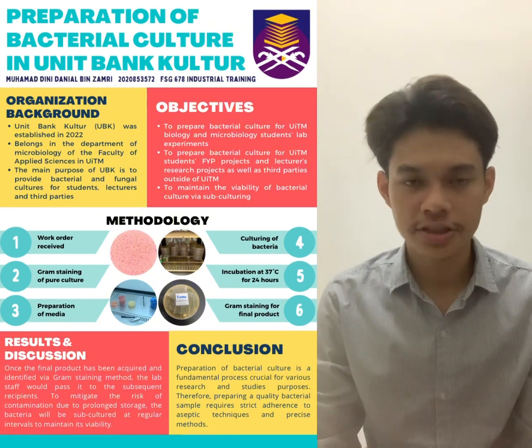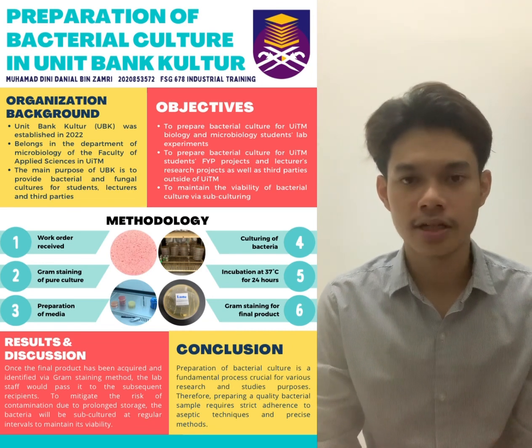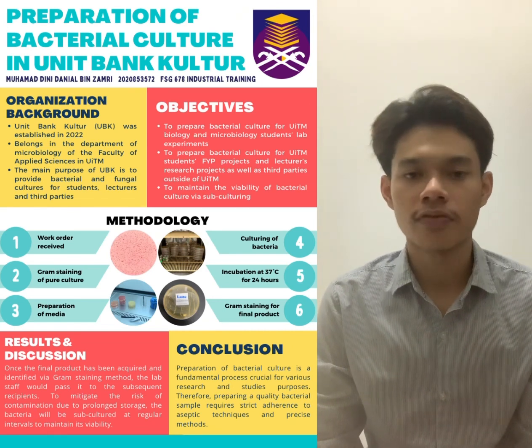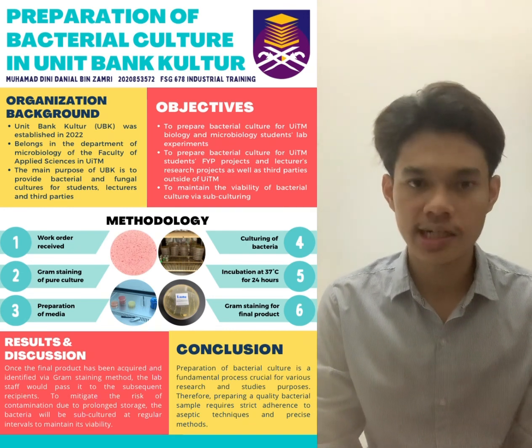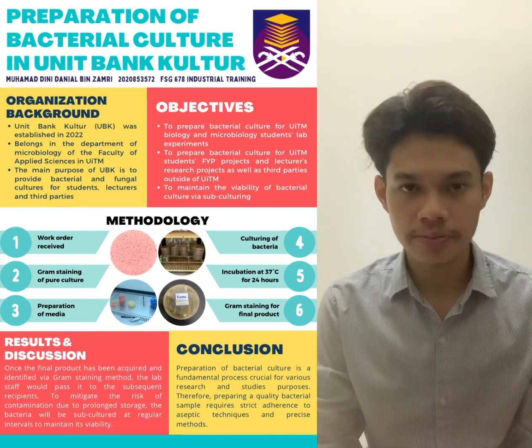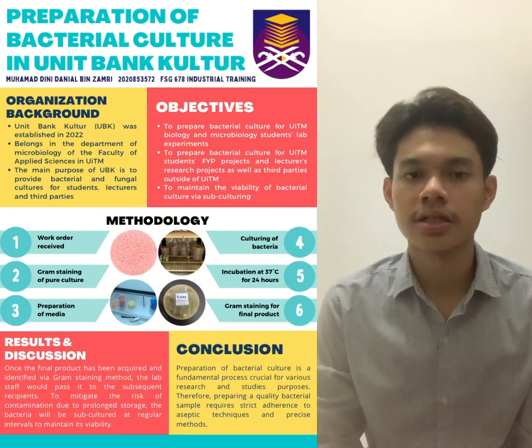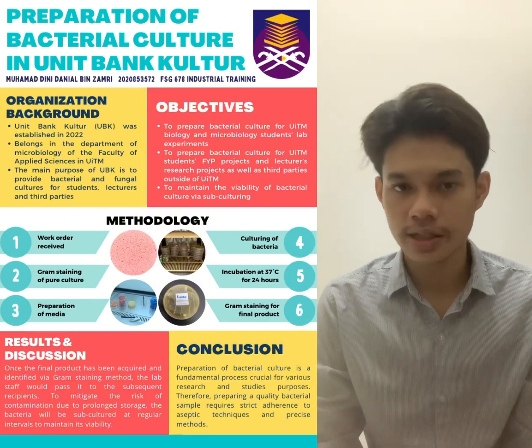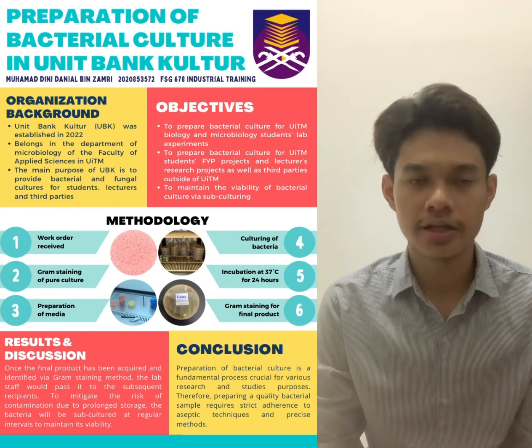For the methodology of my task, I began with receiving a work order from the lab staffs that came in the form of hard copies. Next, I jot down the species of bacteria that is required, the choice of media, and any additional notes. After that, I gram stain the bacterial samples in UBK to identify the type of bacteria and make sure whether it is suitable for growth or not.